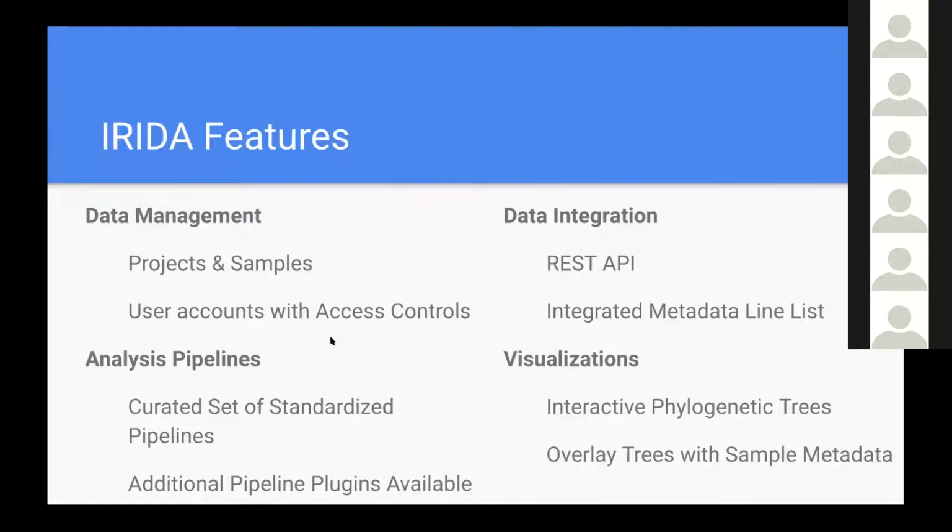Behind the scenes, the pipeline execution environment is Galaxy. So if you have any experience with the Galaxy platform, then you're already halfway there. If you've ever developed a Galaxy pipeline, then you're very close to already having an Irida pipeline plugin.